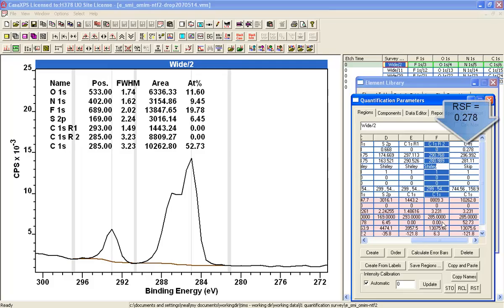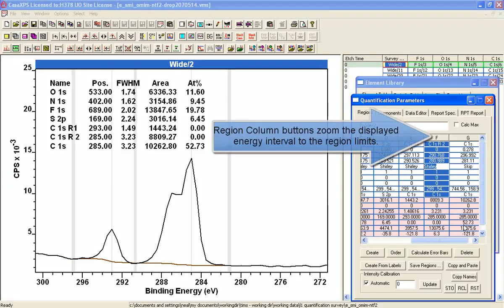As you can see, 0 and 0 for the concentration, but the one peak that I've got a skip background is using the existing background that you see here and integrating the signal above that background and reporting the result here. So we now have the amount of carbon deriving from this skip background region that is across both.